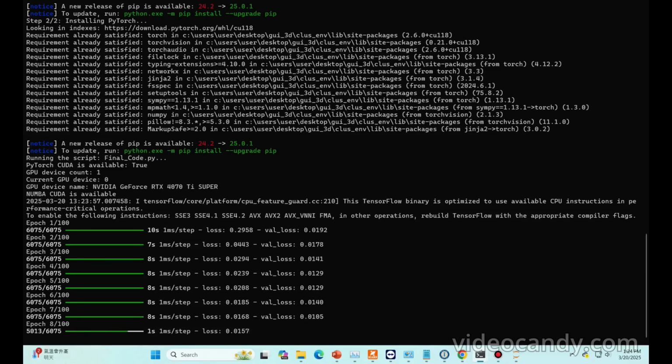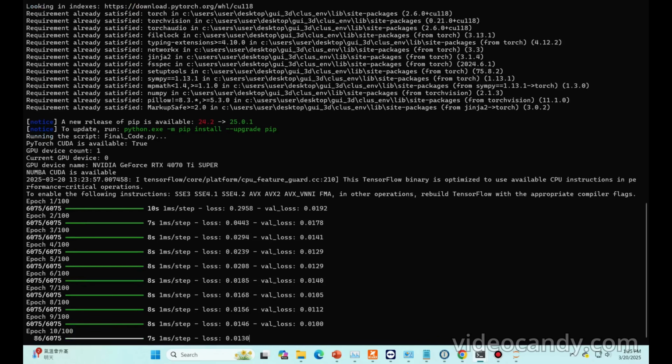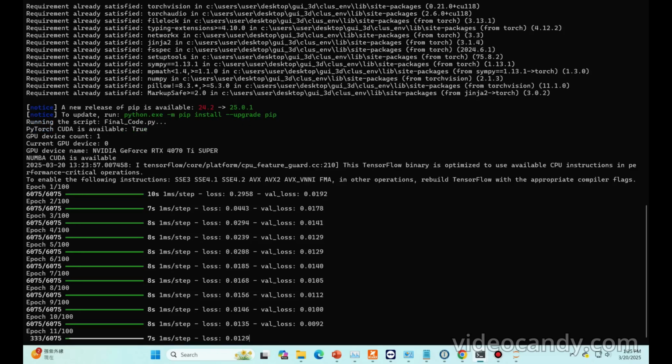And right now they already updated the TensorFlow library, and sometimes you will face a problem. I already mentioned the note on GitHub, my source code link, so you can use PyTorch, and it's already embedded. If you use PyTorch, then you do not need to install the TensorFlow library separately.